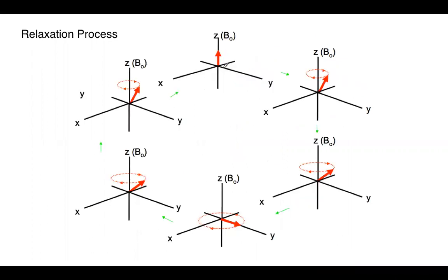So it can go through various processes. The absorbed dipole moment can then precess around a certain direction as it's got energy now, so it can move more. It oscillates with an angular frequency where omega is equal to gamma B, always relative to the magnetic field strength. The stronger the magnet, the more energy that the dipole moment gets. So it precesses more and more as it gets more energy, until the dipole moment is in a perpendicular direction, or basically just in a different direction than the original. So here it's flipped, it's gone from the Z-axis alignment to the Y-axis alignment.